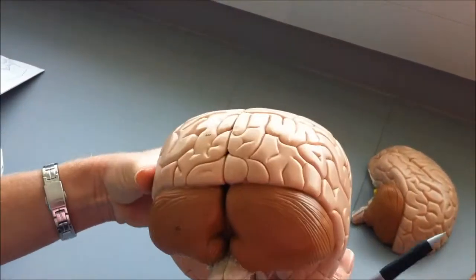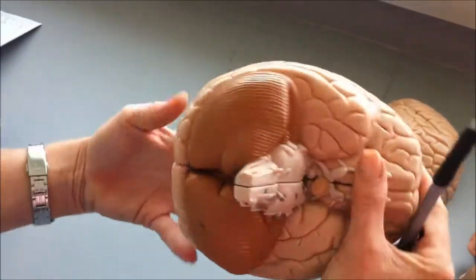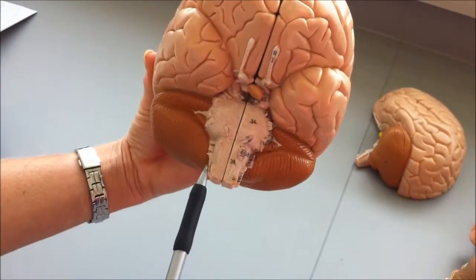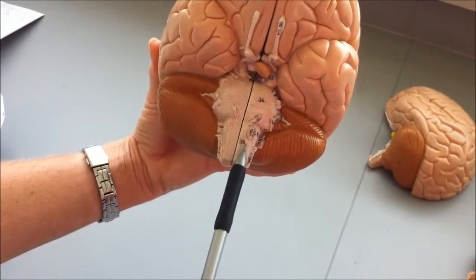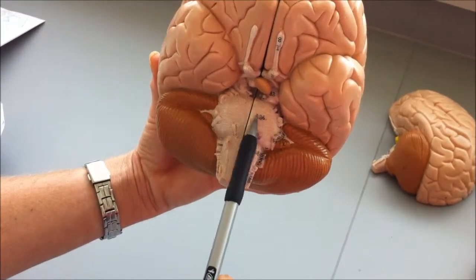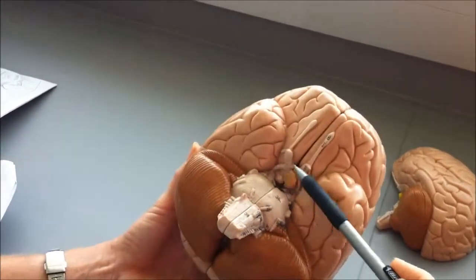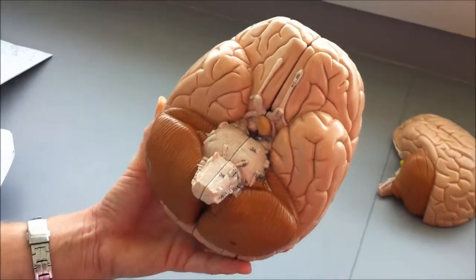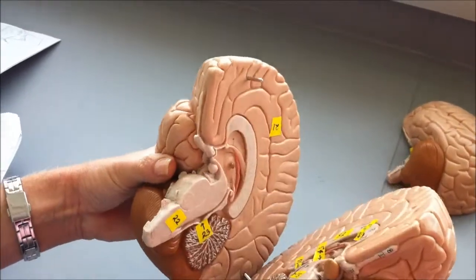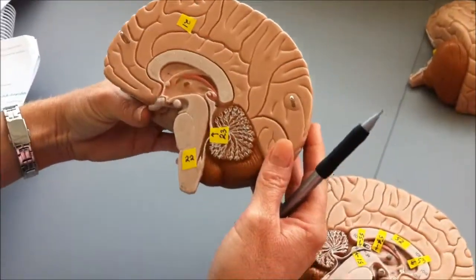You then have your cerebellum, your medulla oblongata, your pons, and then the midbrain, which we will open up to show you a couple things.